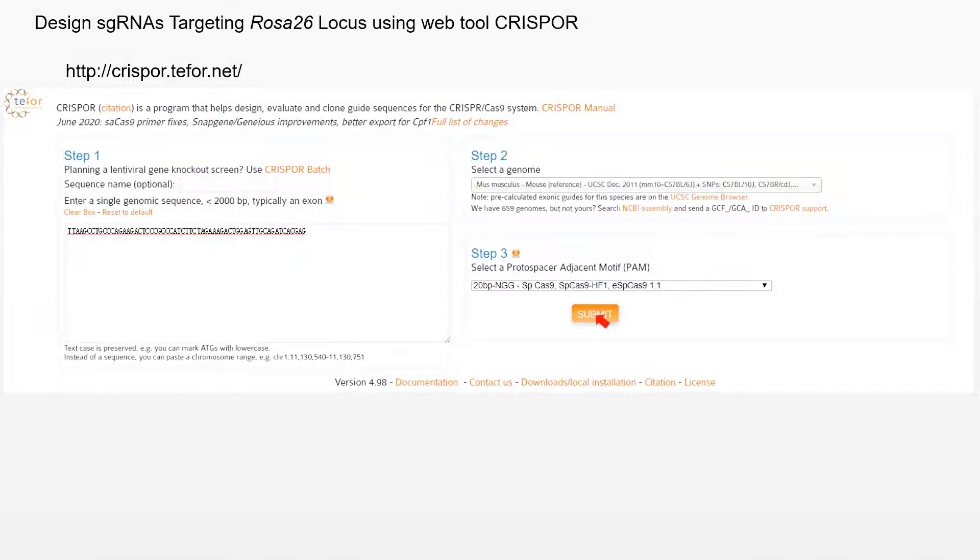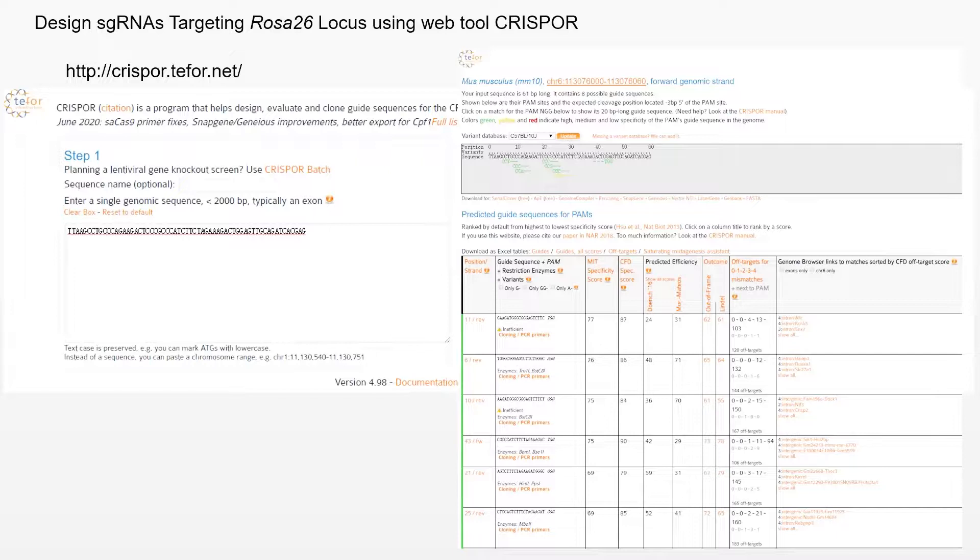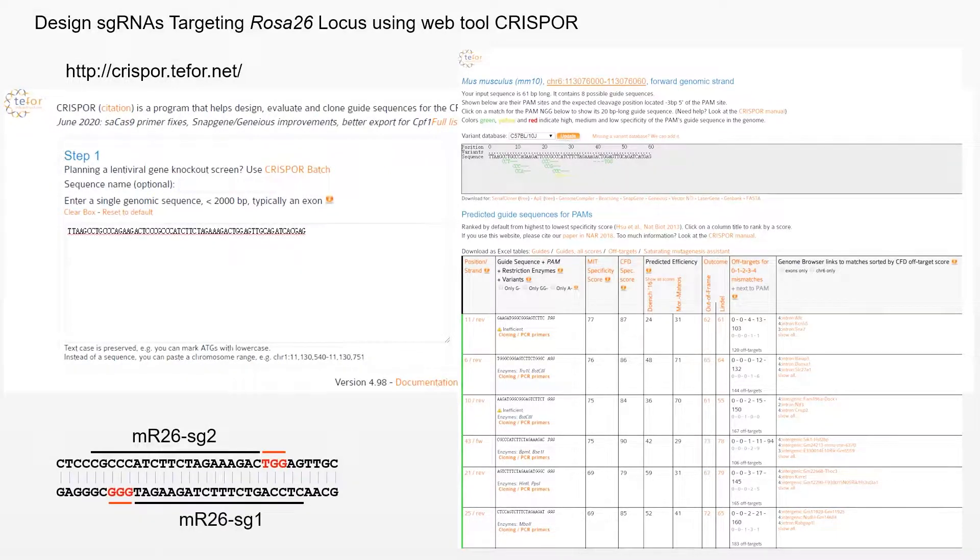Click Submit. Choose guides with a high specificity score, high cleavage score, and fewer off-targets. Guides indicated as inefficient should be avoided. Notably, it is preferred to select two guides with overlapping sequences, which may increase knock-in efficiency as reported.